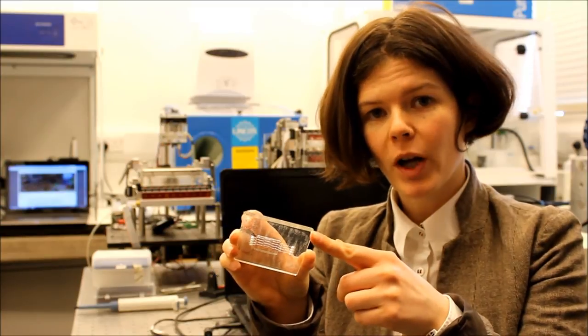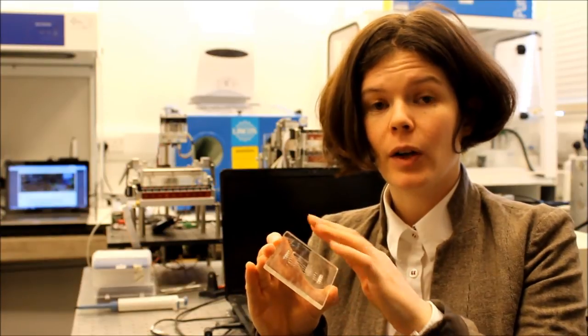Additionally, our system is very cost effective as it is based on a decoupling principle. The fluidic layer is isolated in the disposable chip, made of two elements. A block of PMMA which hosts the microfluidic channels and the valve and pump seats, and an elastomeric deformable layer which seals the channels and allows the opening and closing of the valves via compressed air.